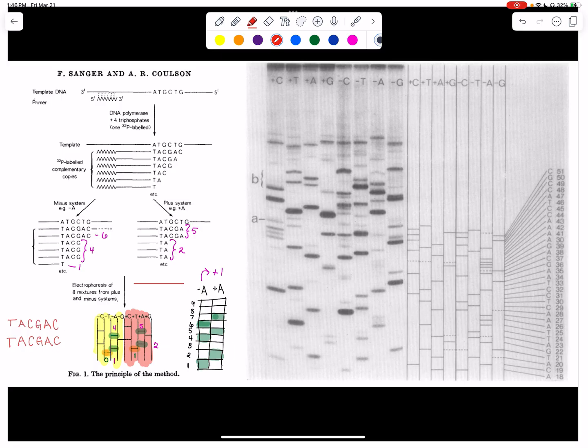And so in the context of this paper, what they wanted to determine and confirm was whether we effectively got a change in nucleotides. That was ultimately what they showed when looking at the gels from the paper. So, for instance, if we wanted to change a C instead of a G, we would just look for that in the sequencing results. Hopefully this is a little bit clearer, and helps explain why the bands were specific discrete lengths versus such a range, and how we can utilize this technique to better understand sequencing.